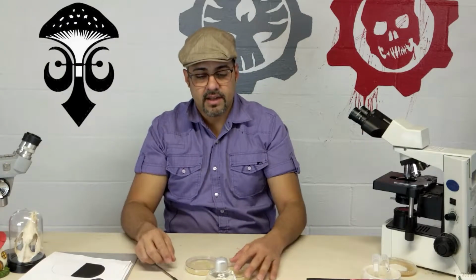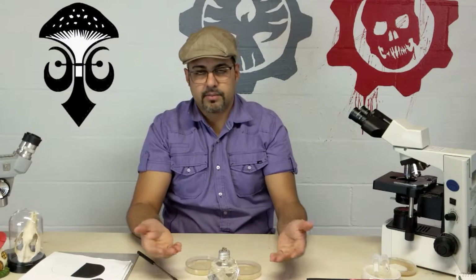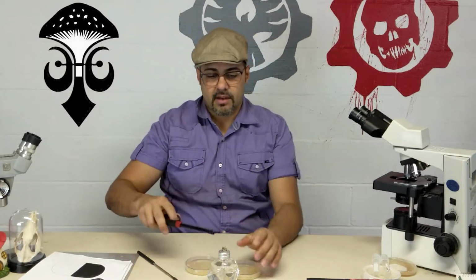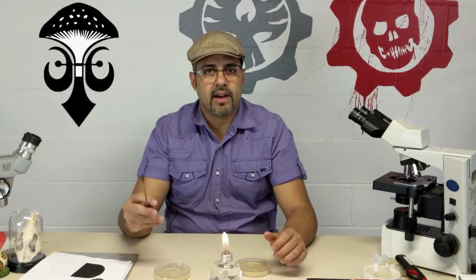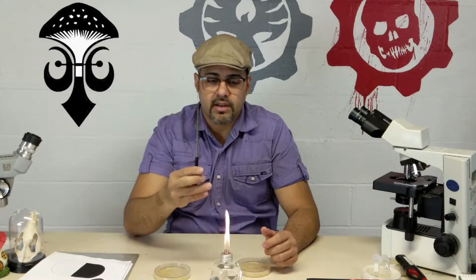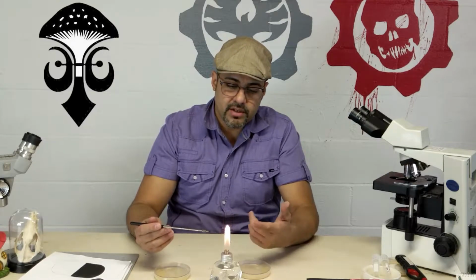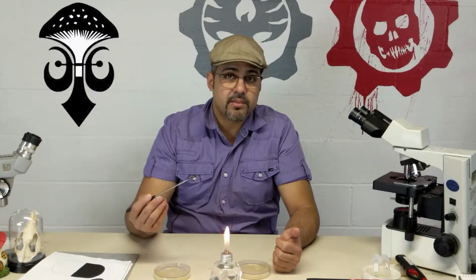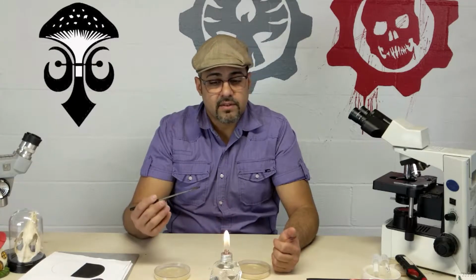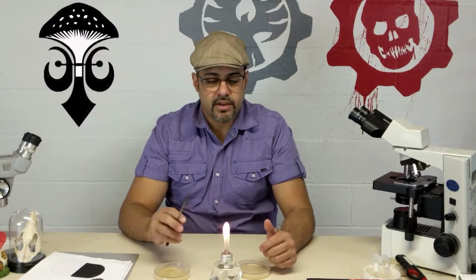So if we don't have that, then we need a Bunsen burner. In this case, it's not a Bunsen burner. It's pretty much a burner that has ethanol. But you need fire. Why fire? Because we need to sterilize your inoculation loop. When you sterilize your inoculation loop, you need to put it exactly on the flame, and you will see when it's pretty much literally red hot. After it's literally red hot, then you can continue doing your transfers.